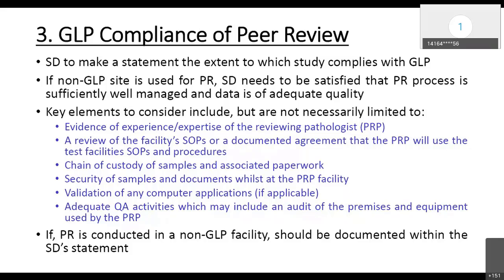gather enough information about the peer review pathologist, like what is the experience of peer review pathologists, what is the expertise of the reviewing pathologist, a review of the test facility SOP or a documented agreement that peer review pathologists will use the test facility SOPs and procedure.